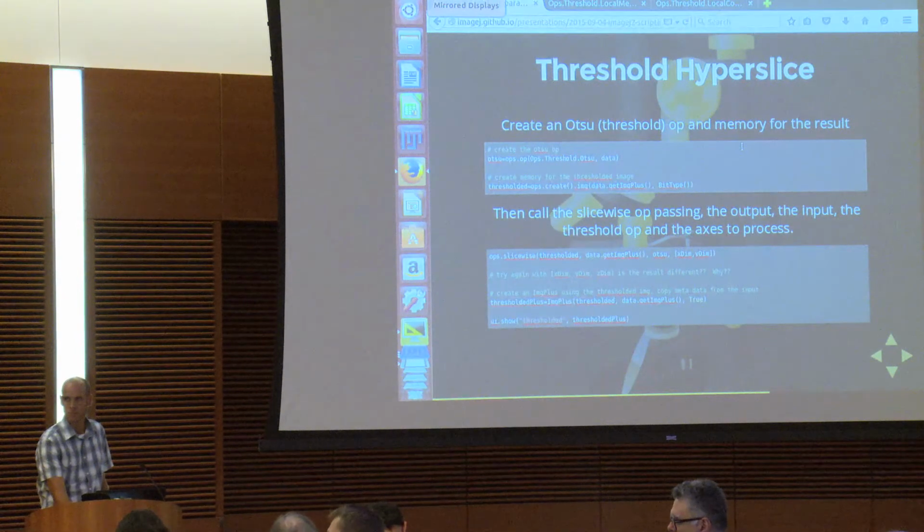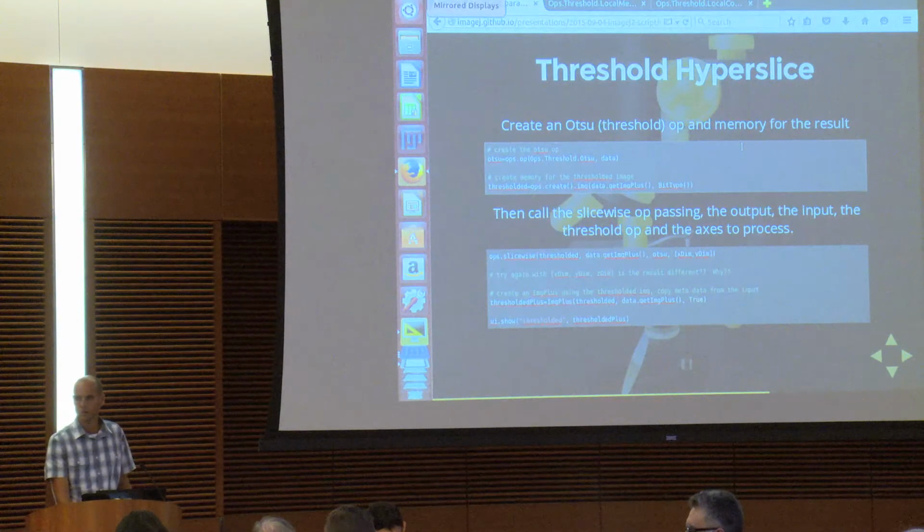For example, we have an op called the loop op, and it takes as input another op and the number of times you want to loop. Say you have an image and you want to add it to another image, and you want to iterate this 10 times. You run the loop op and you fix the image you want to add 10 times as the fixed input.